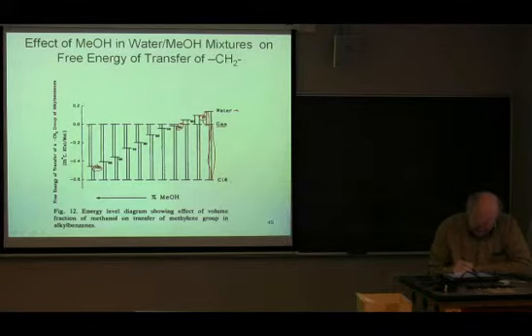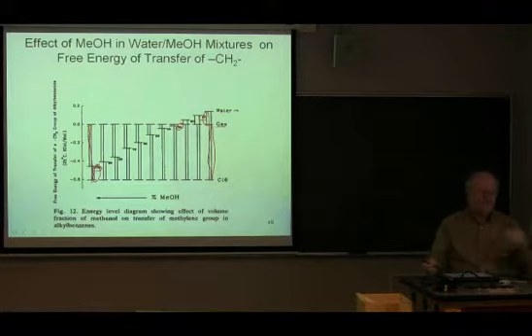This is the contribution from gas to methanol, and this is the contribution from gas to hexadecane, and there's the reverse phase process. It's gotten a lot less favorable. The transfer from the mobile phase to the stationary phase becomes less favorable as we add organic solvent to the water.